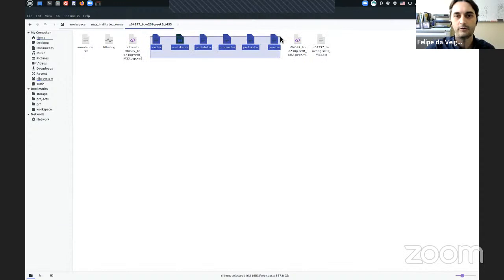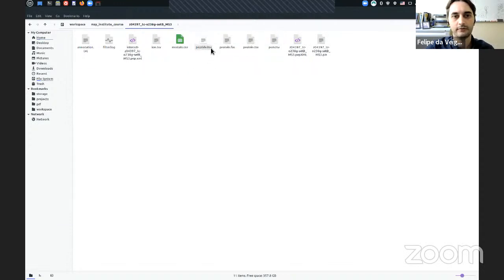Now, the most important ones are these here that end with TSV. So basically, all the data from the experiments are broken down or separated into what we call layers, and they are filtered individually. From the PSMs, we assemble protein lists, peptide lists, and ion lists. These tables look very similar to each other. Some might be more important than others. You might use just one, or you might use all. It depends on what kind of experiment you have and what you're trying to do.